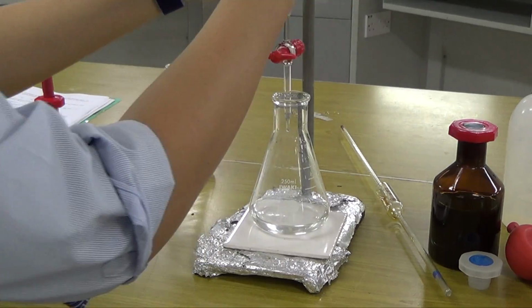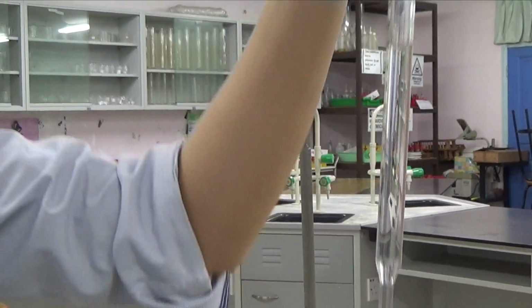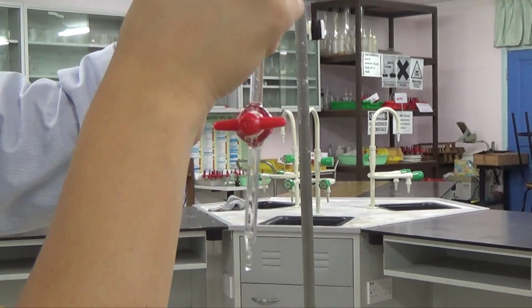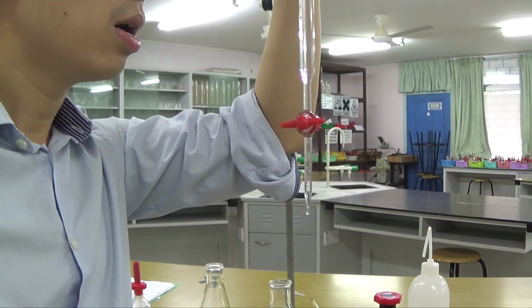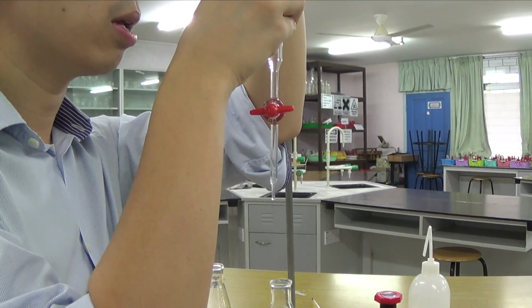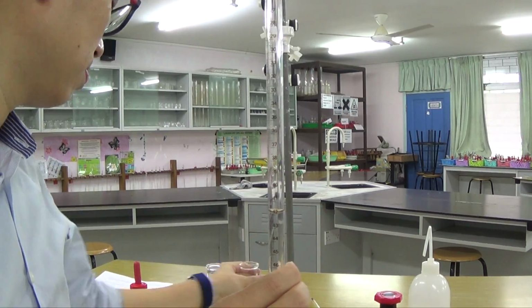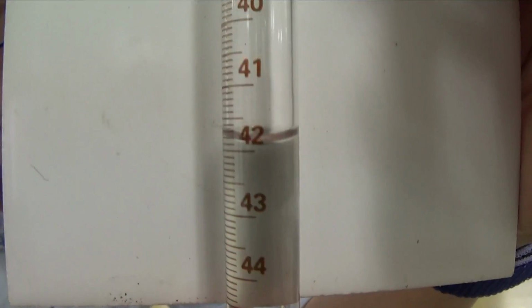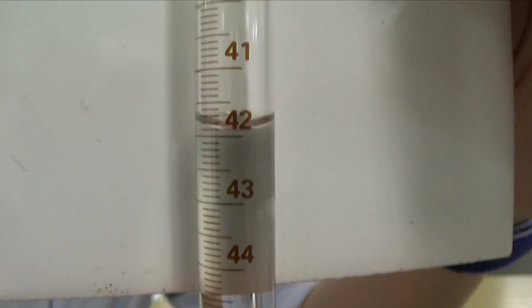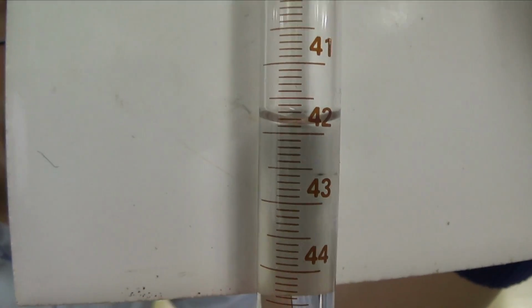Okay? Now ready to read the reading of the burette. So there's my endpoint, there's my accurate endpoint. I knew it was accurate because I did it drop by drop. So, oops, I don't want to zoom in. So that is 41.9 cm cube. You should hopefully see that, 41.9 cm cube. Let me just twist it around. So 41 on top there, 41.9 if you read below the meniscus there. Okay, 41.9 cm cube.